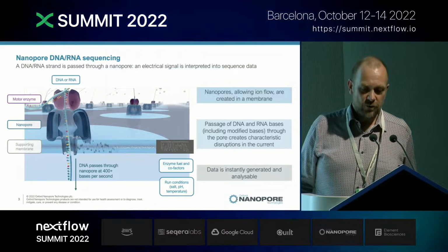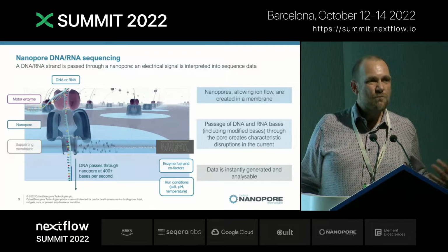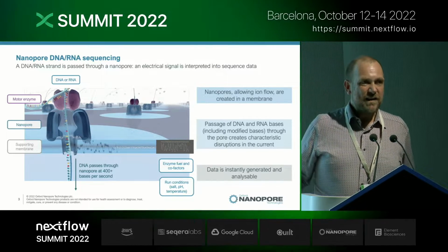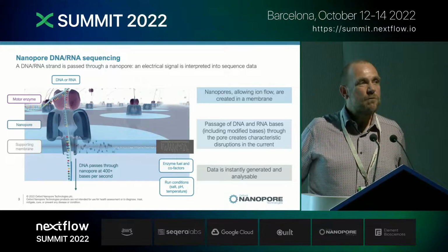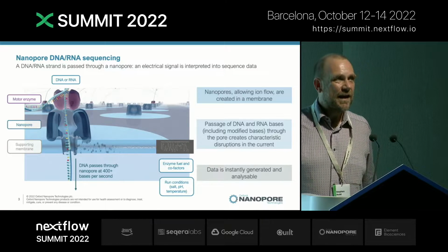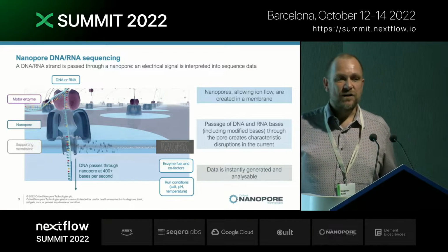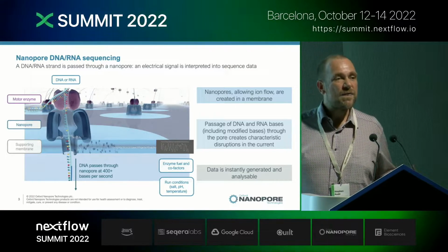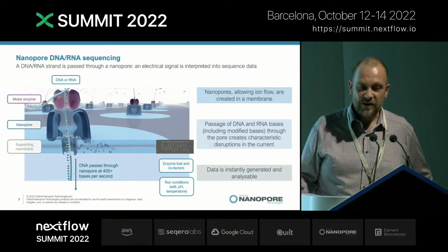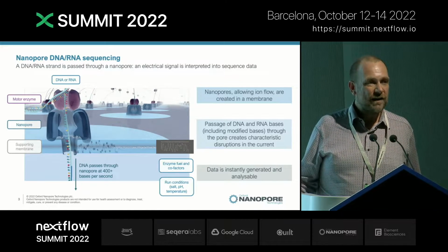This is the concept of nanopore sequencing. The animated graphic behind is giving just a brief overview as to how nanopore sequencing really works. So you can see the DNA molecule. The DNA molecule has been recruited to the nanopore, and the motor protein is feeding single-stranded DNA through the pore. The pore protein has been genetically modified to our specifications to give particular characteristics through which we can then observe the flow of current across the membrane on which the pore has been localized. The DNA transits the pore at a speed of about 400 nucleotides per second.